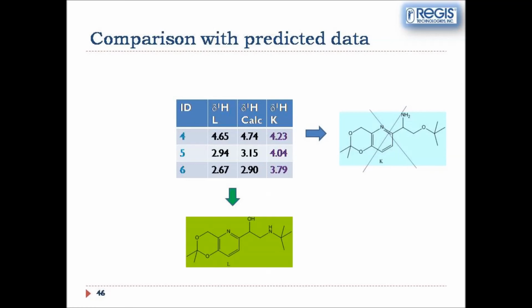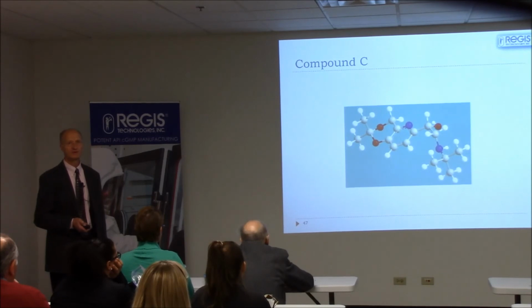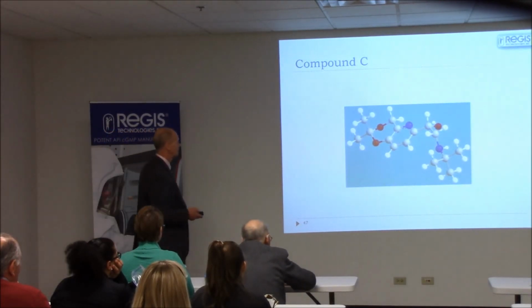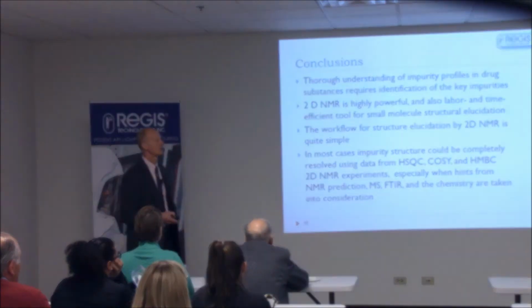So in these 3 case studies, using a relatively simple workflow, we can elucidate the structure and understand what impurities are built during the process.